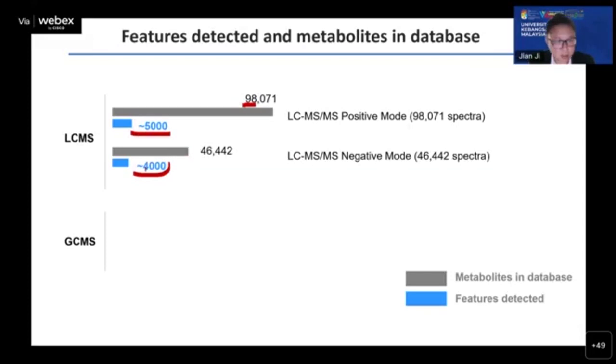So the library is much bigger, even huge, compared to the spectra we detected.